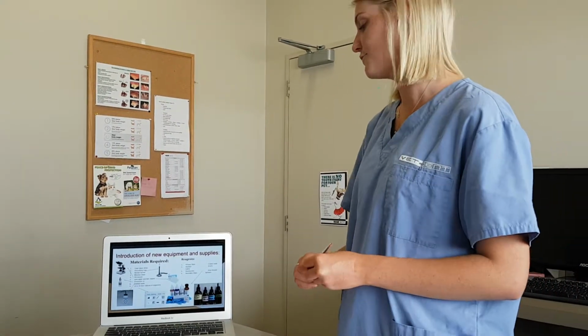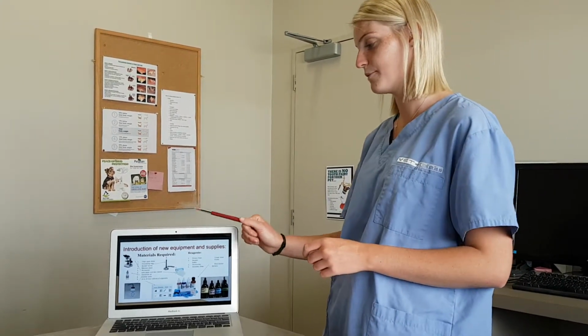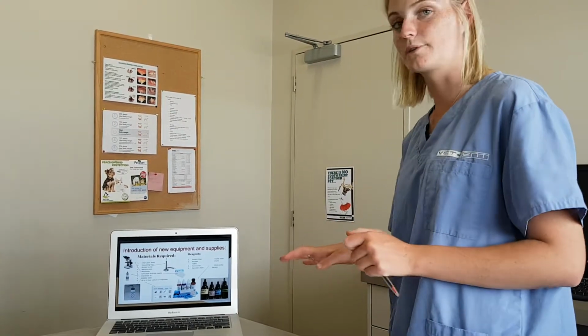Then, introduction of new equipment and supplies. So we've just sort of listed the materials that are needed. We've got glass slides, which we already have here.